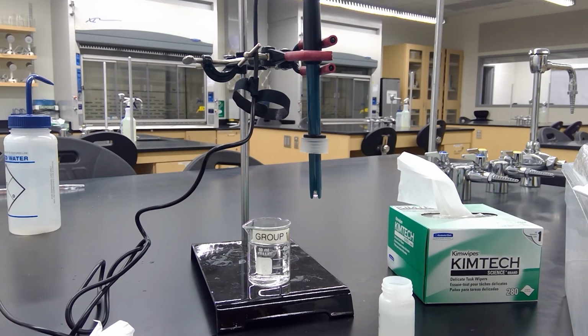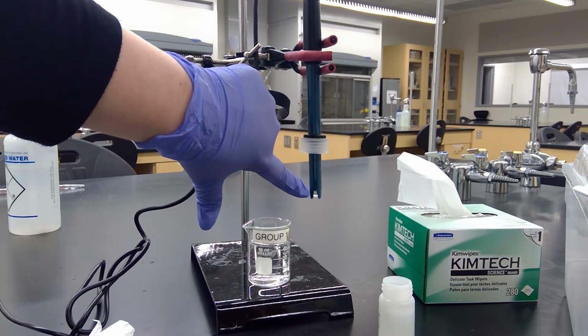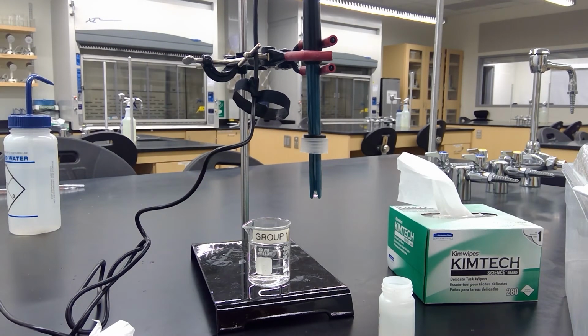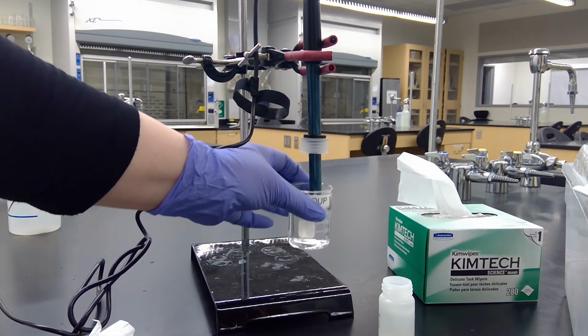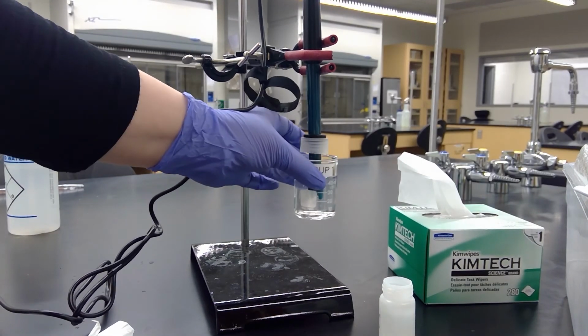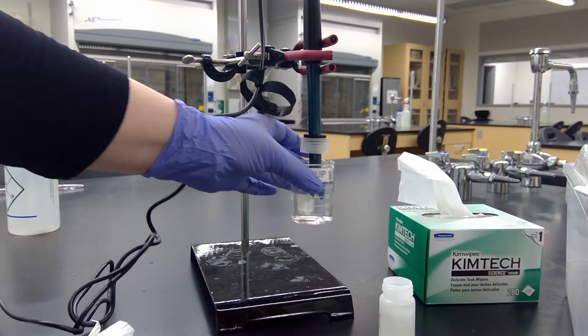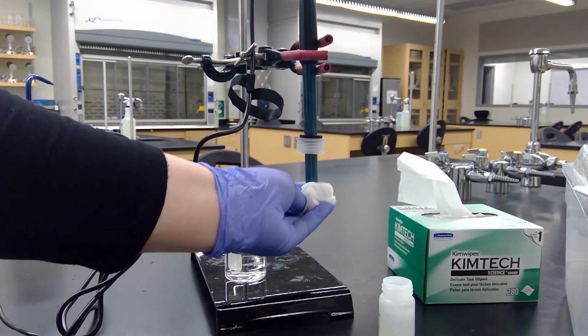Rinse the pH sensor by submerging it into the water. Be careful not to hit it against the bottom of the beaker. So there's a little bulb at the end, and that's where it takes its reading, but this is glass, so you have to be careful not to break that. So you want to rinse it, and then blot it again.